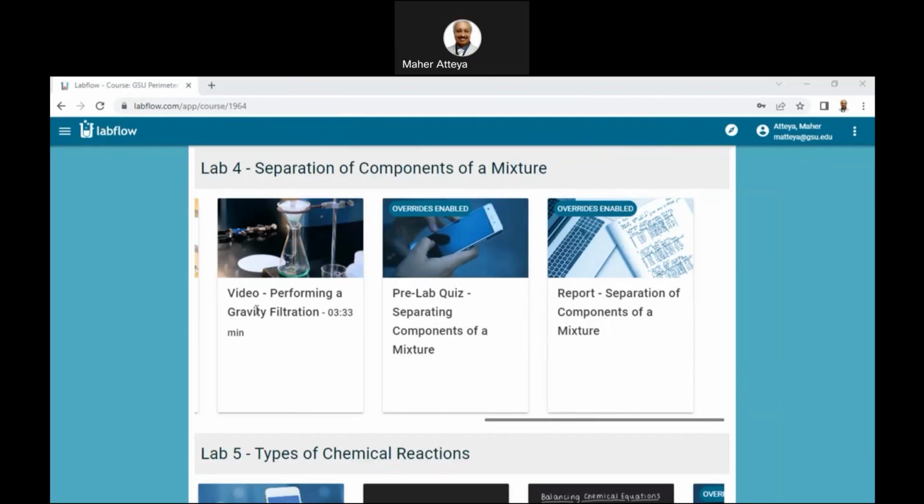Okay, so guys, let's move this one here. Now we have two files we are concerned about. This is the theoretical background. And this is not the lab report as yet, so I'll take the lab report out. We'll add it later, but at least this one here is the procedure, or how we are entering the whole thing. When it comes to the lab report, we'll come and do it together.